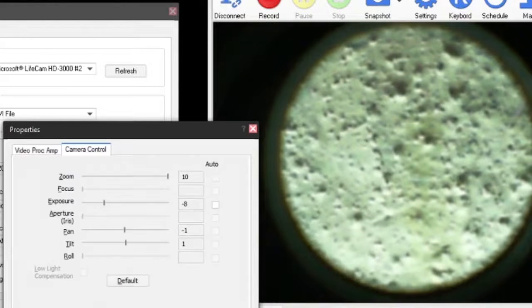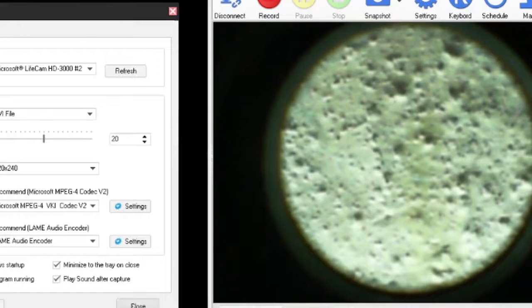Okay, so we say apply, close, and there it is. So we are live, and we did this focusing on lead tin yellow, and now I would like to do the actual experiment and get a Raman spectrum.